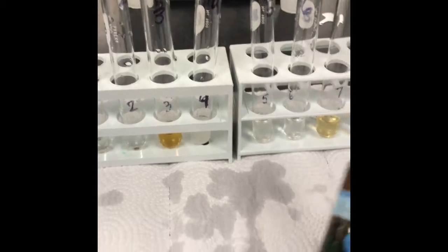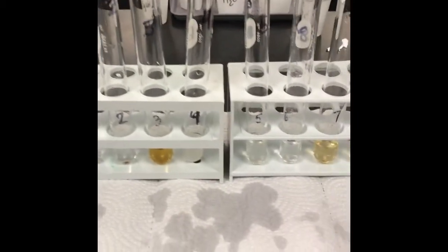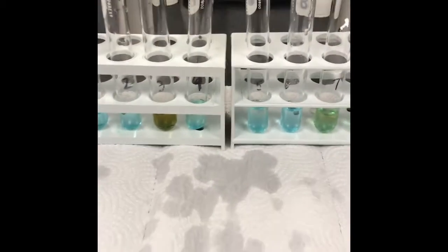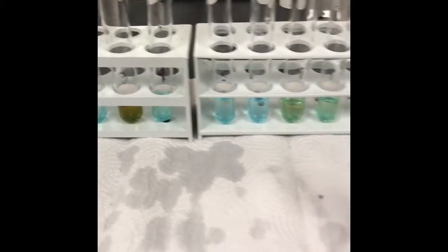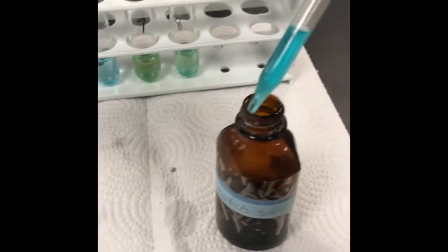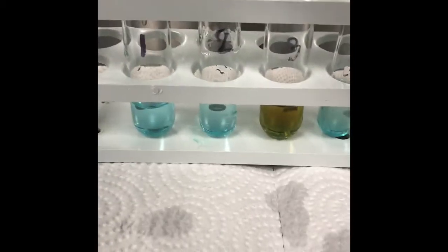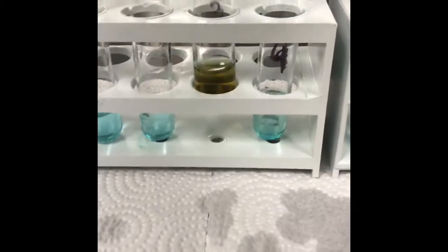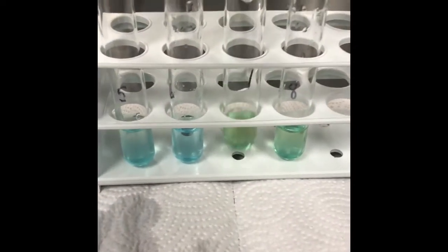I'm going to go ahead and add my drops of Benedict solution to my test tubes, and then I'll show you putting it in the hot water bath. Okay, we've added our Benedict solution to all of our test tubes. I did want to show you what the Benedict's reagent looks like naturally before we added it. Here we go, this is Benedict's reagent. It's a beautiful little blue color. So the solutions that are clear, like our first 2, water and table sugar, are simply the color of Benedict's reagent. The shades that you see that change like this are before heating, so we're not recording any positives yet.